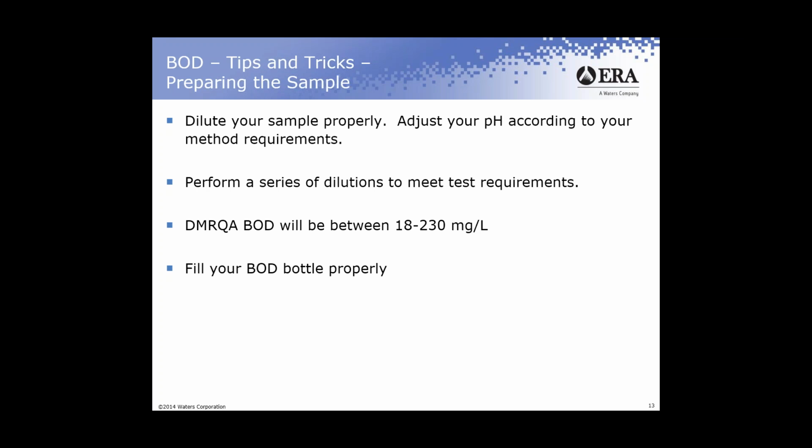It's dilute enough that you can raise the pH slowly into your range, but strong enough that you're not adding too much volume to your sample and affecting it. A 0.2 normal sodium hydroxide solution, if you have sodium hydroxide pellets in your laboratory, 8 grams of that to a liter will give you a 0.2 normal solution. And again, it's a good working concentration.